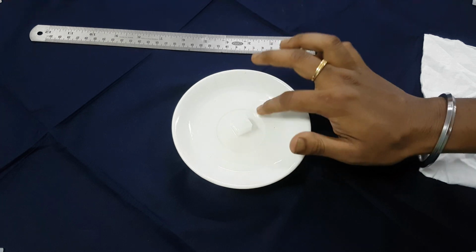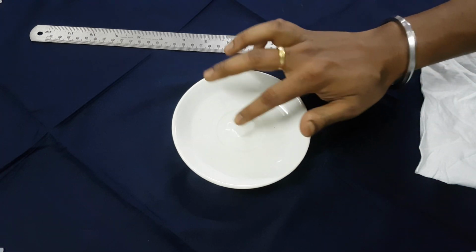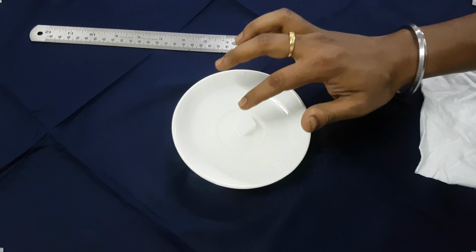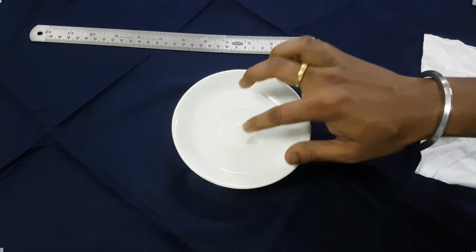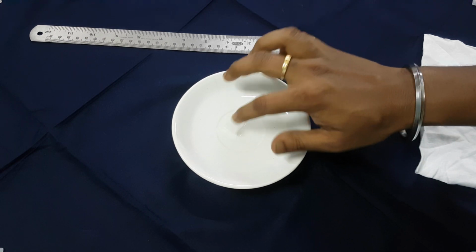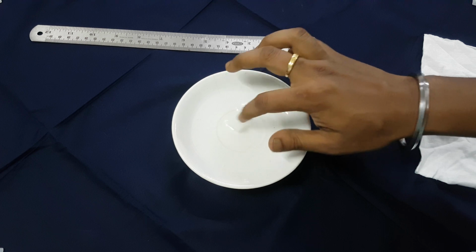Okay, same thing, and then we'll see any change in dimensions in the sugar cube itself. Yesterday we observed a change in dimension.